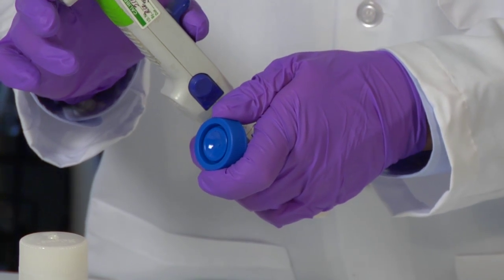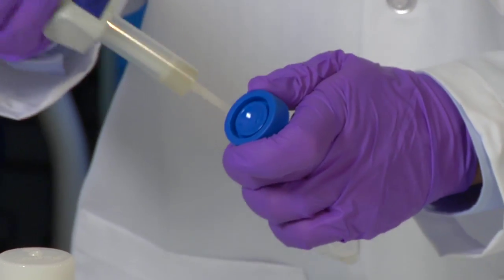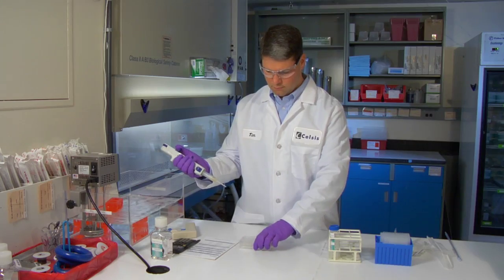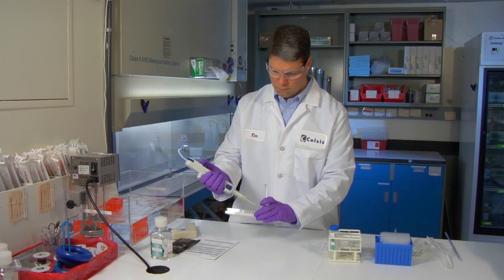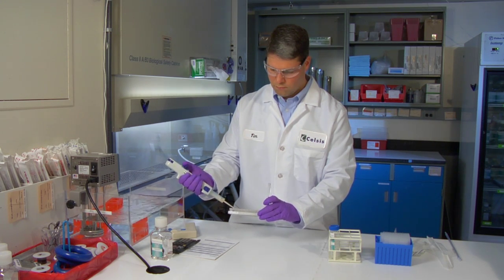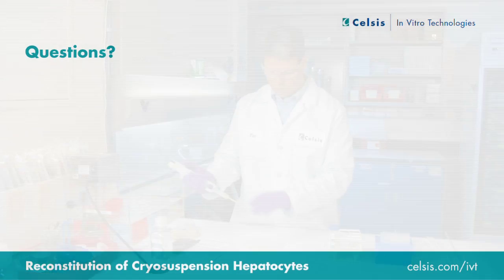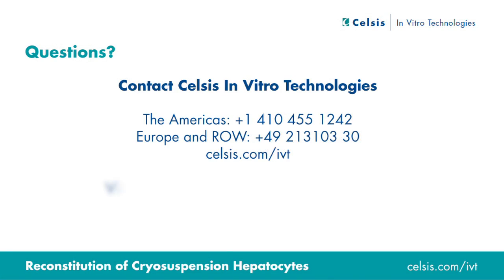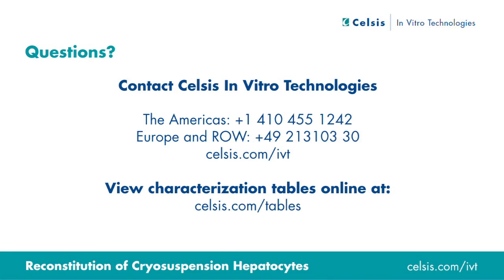The reconstituted cells are now ready to be used in a metabolism suspension assay. Simply aliquot the cells into the plate format of your choice. Remember, if you want to use a different type of plate or are using the cells for uptake transporter studies, your target and reconstituted numbers may be different. If you have any questions about anything shown in this video, please contact CELSIS In Vitro Technologies or visit our website. Full characterization of available lots is online at celsis.com/tables.